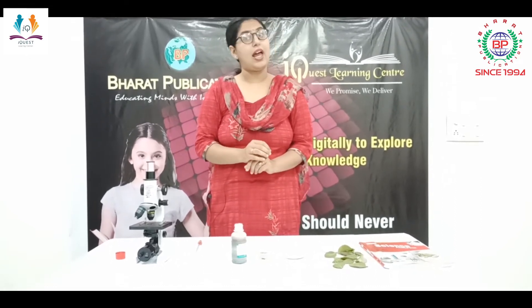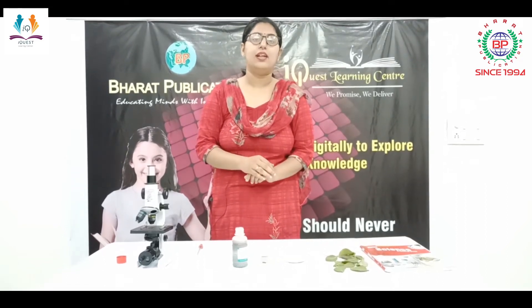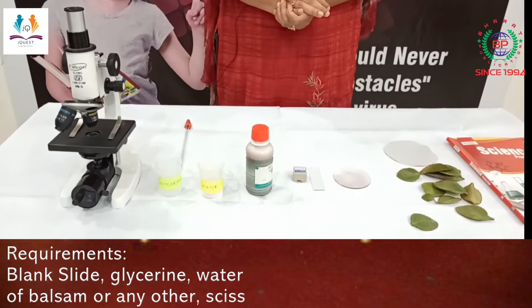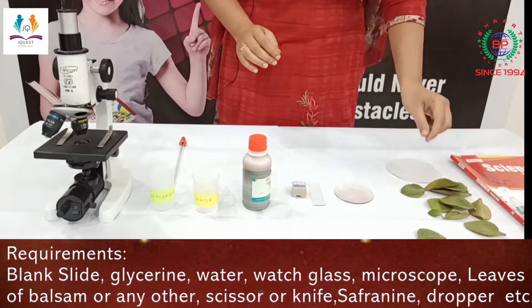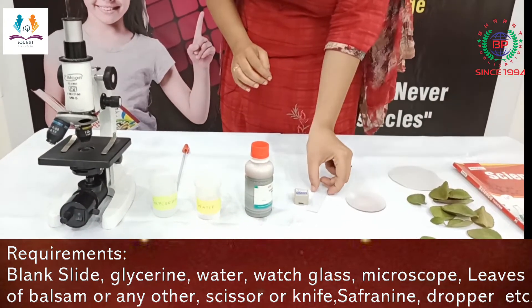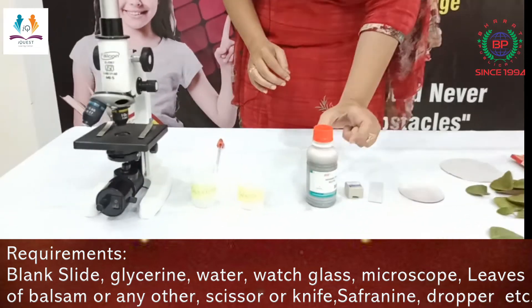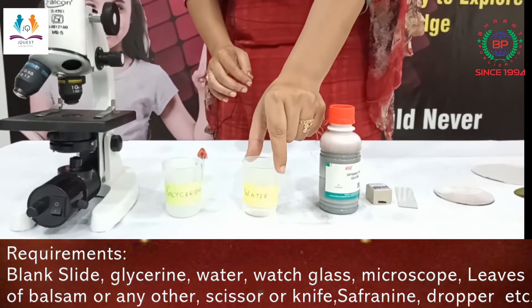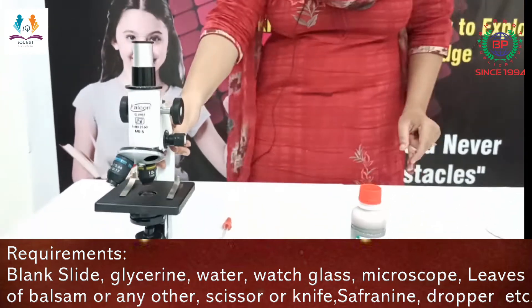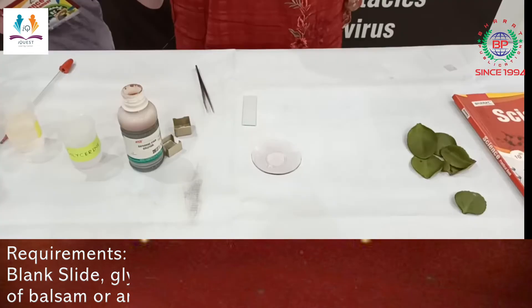The opening and closure of stomata are both controlled by the guard cells. For this experiment we require the following materials: firstly a leaf, then a watch glass, blank slide, cover slip, stain safranin, water, glycerin, a dropper, and a compound microscope to view the microscopic structure.